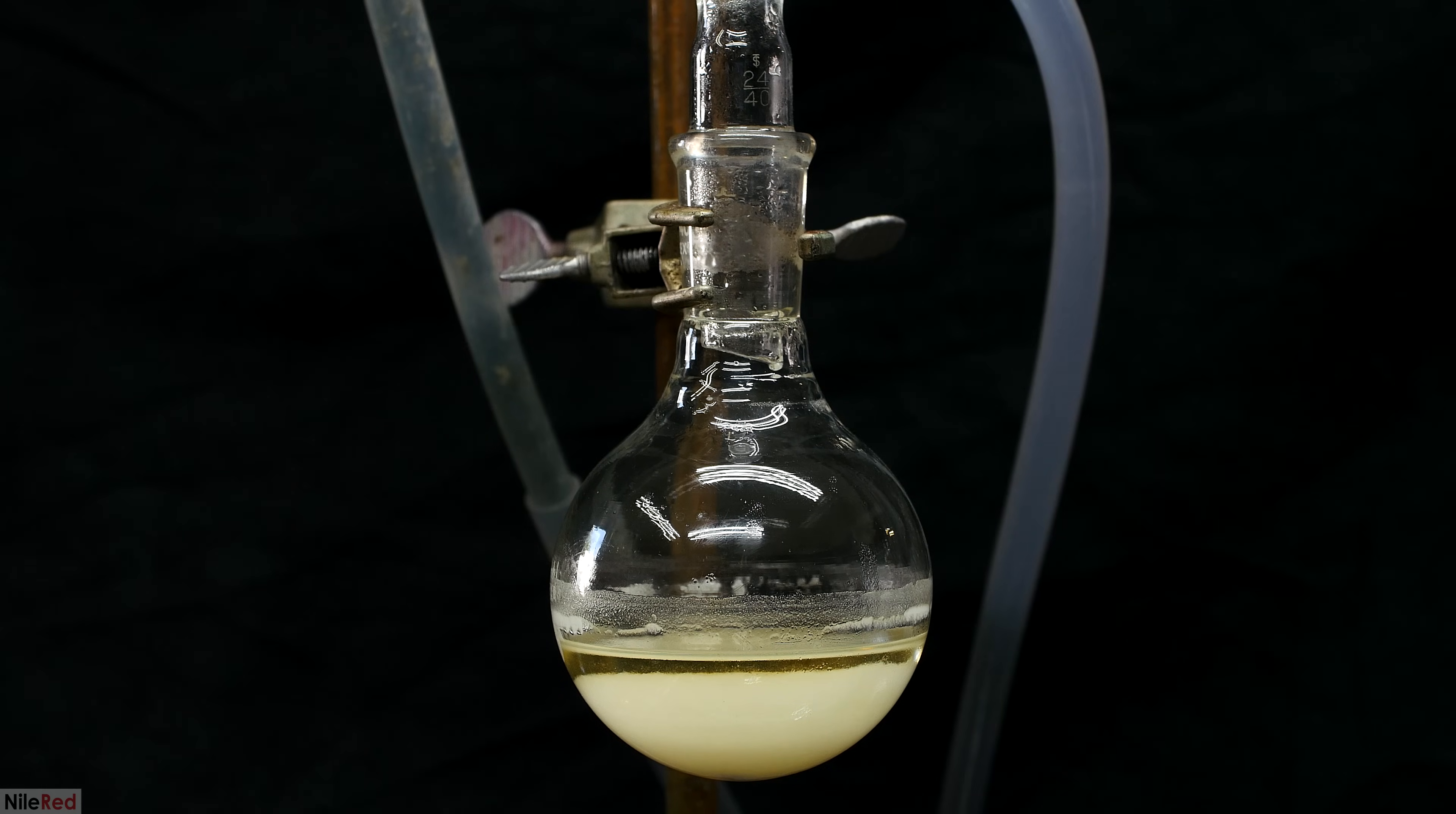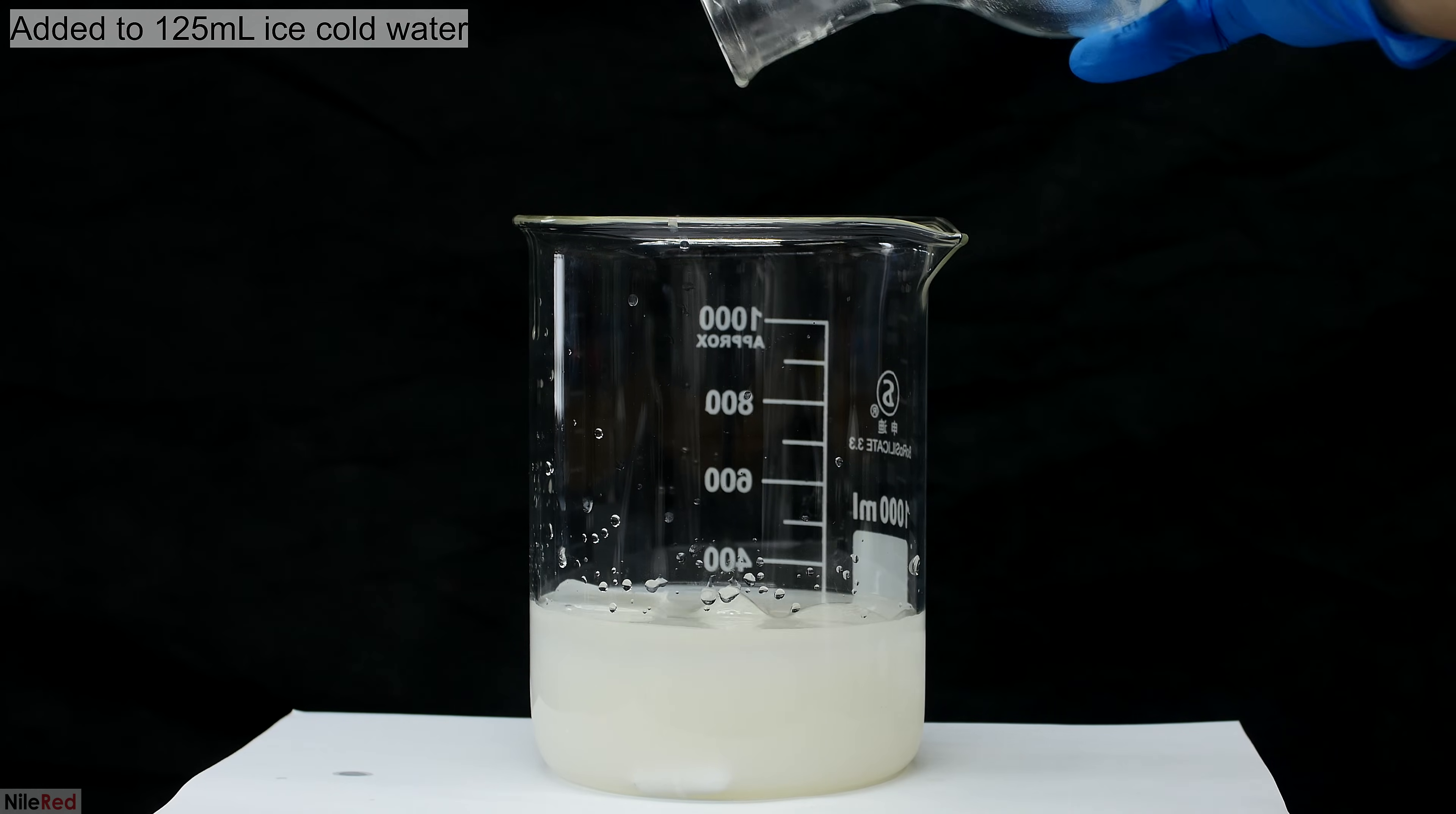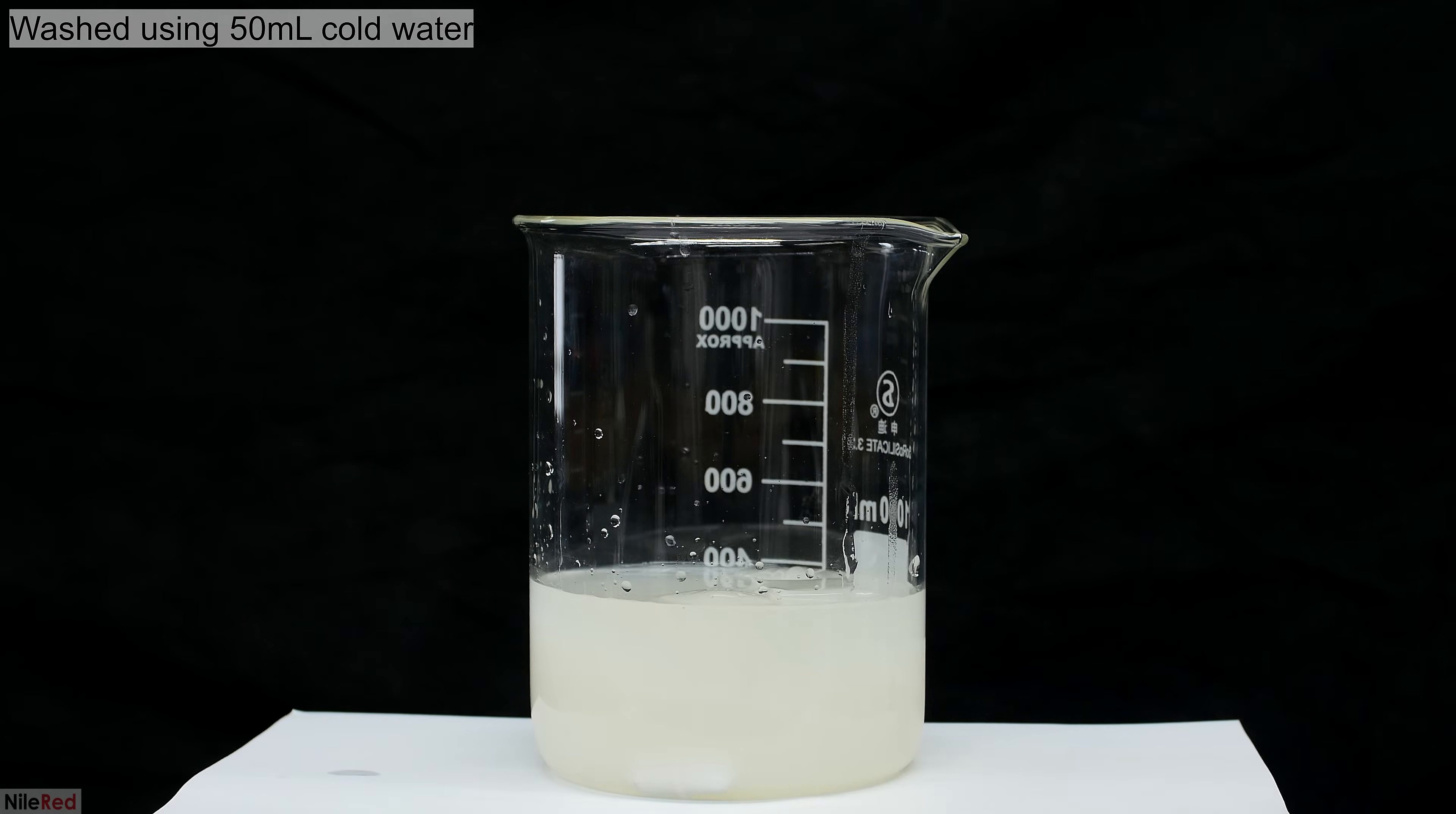I remove the oil bath and I let the reaction mixture cool down to room temperature. Once it gets to around room temperature, I pour the reaction mixture into about 200 milliliters of ice cold water. I wash the flask with about 50 milliliters of cold water and I add that to the beaker as well.